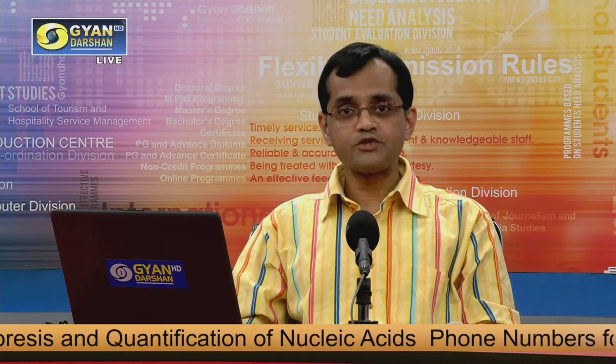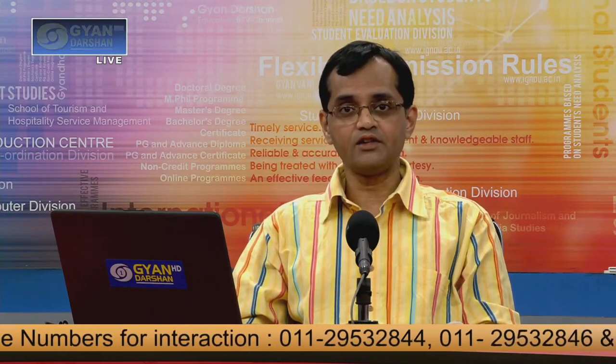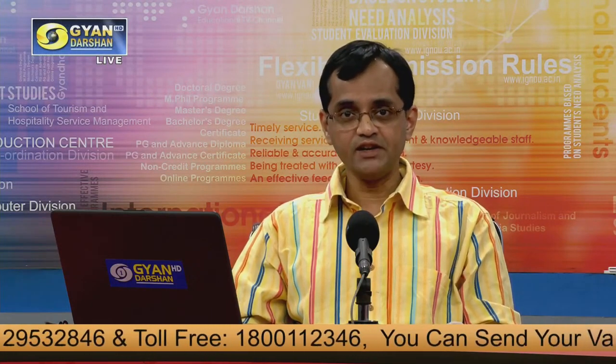Now, there are 3 experiments: isolation of plasmid DNA, agarose gel electrophoresis, and quantification of nucleic acid. So we begin with the first experiment, that is isolation of plasmid DNA, and these are probably experiments 10, 11 and 12, which you will find in your laboratory manual that has already been uploaded in eGyanKosh. You can find this entire laboratory course manual in your eGyanKosh. So you can download it and start studying the manual.